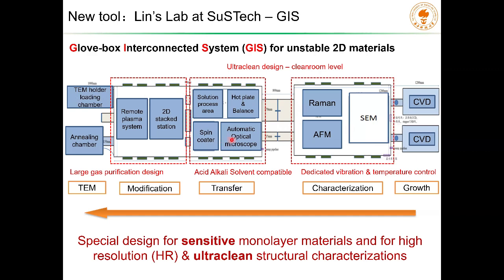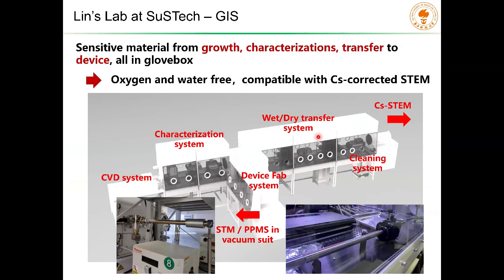Okay, so there's no commercial design, and we designed this system by ourselves. So we now can achieve an oxygen- and water-free environment, compatible with the CS-corrected STEM. All the equipment is integrated inside this glovebox system so that we can do the whole experiment without exposing to air.